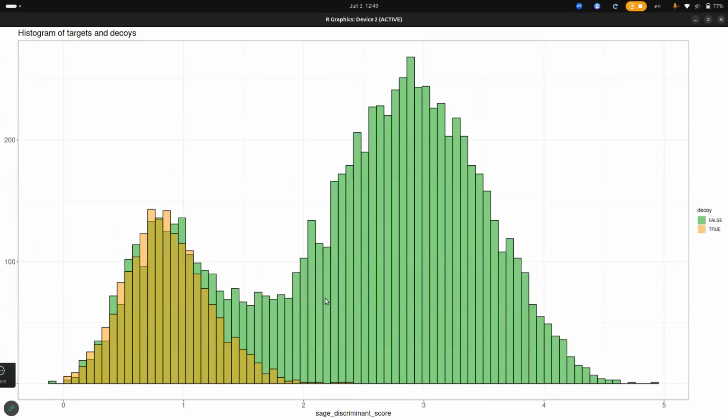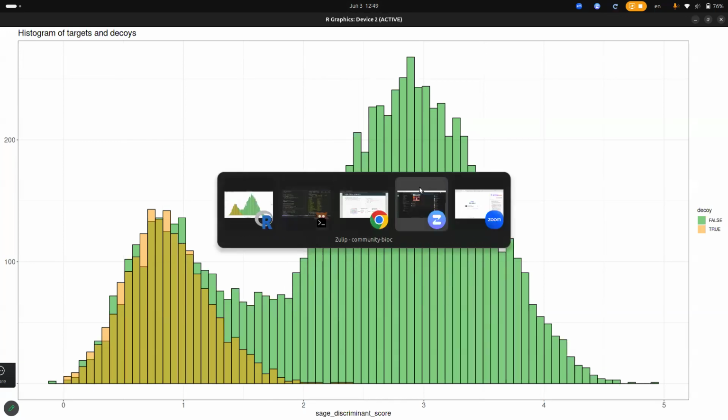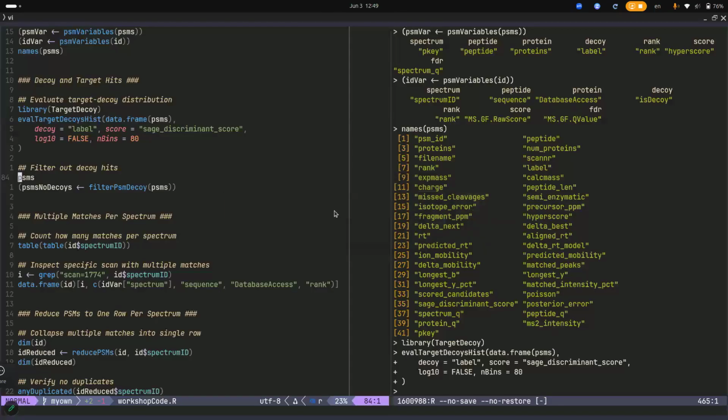So the false discovery rate is typically estimated using these decoys, and we often apply a filter around 1%, 5%, depending on the use cases. And so, for instance, the further away the second peak is, the more targets you would have. Here, the 1% would be around here, and so you'd get fewer hits than if the distribution was further away. Go back here.